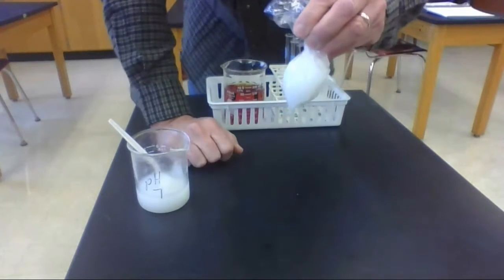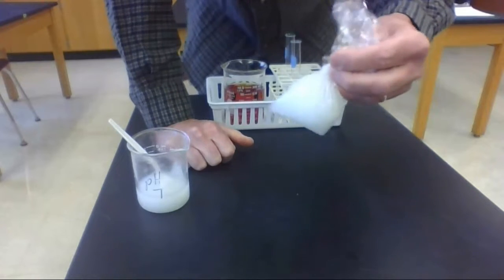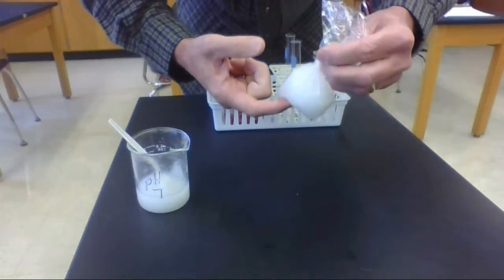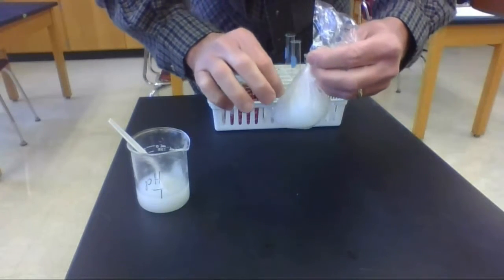Now, the idea is, this is the model of a cell. So ask yourself, if this is a model of a cell, what does the baggie represent? And what does the starch solution represent?